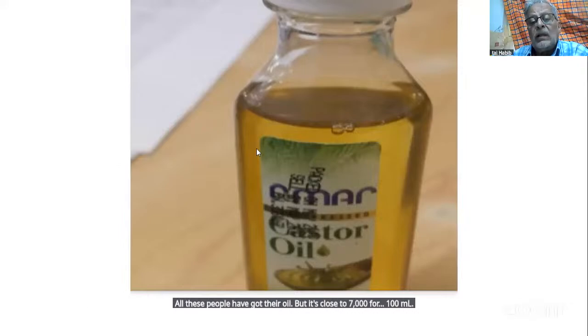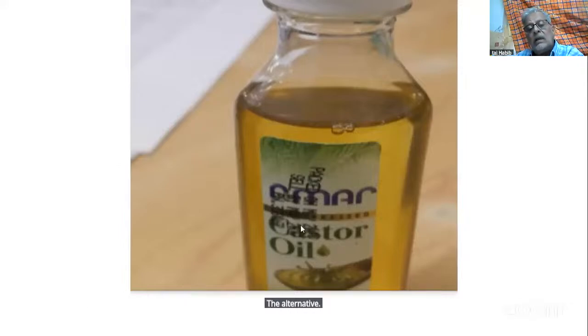The alternative, locally, is to use castor oil. You'll find it in your own pharmacy. It's a little thick, slightly yellow colored, but it doesn't dry. And because the refractive index is 1.5, the vision is very clear, absolutely clear.